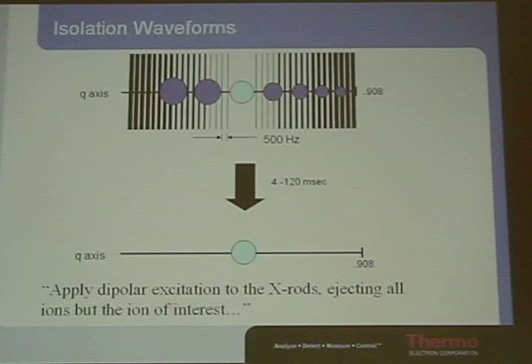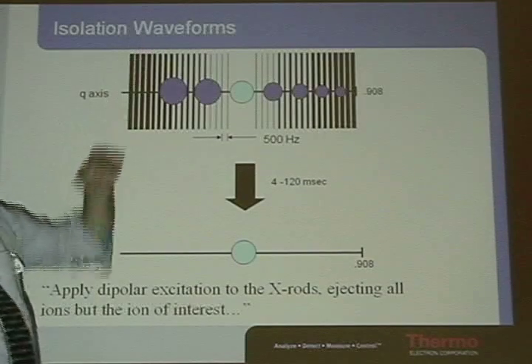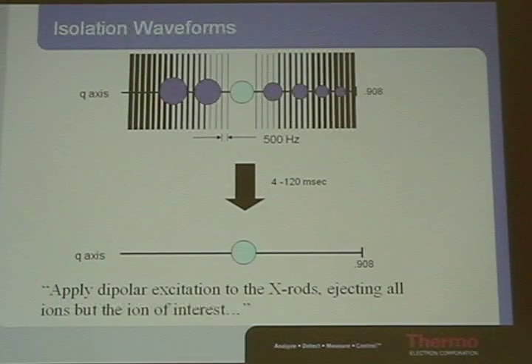So what we've just accomplished allows us to acquire a full MS spectrum to see what peaks are eluting. What's the next step we want to do? Blow them apart. We want to do fragmentation. The first thing we do is isolation. We purify and get rid of all the other ions that are eluting except the ion of interest.